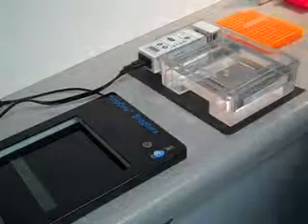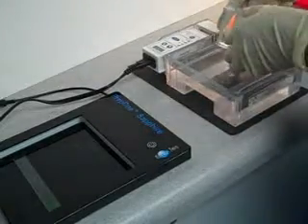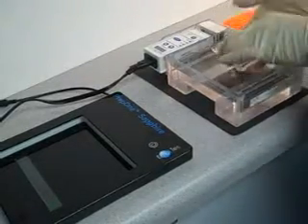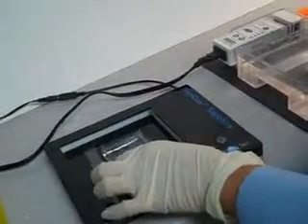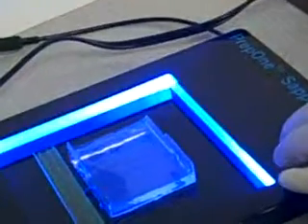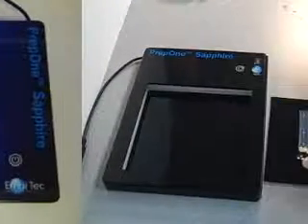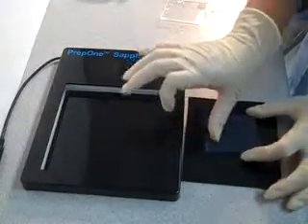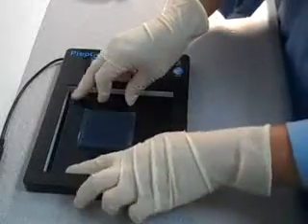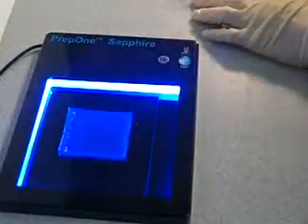When the timer beeps, lift the gel from the tank and place it directly onto the Prep 1 Sapphire unit. You can use our unit to easily check how far the bands have gone. Remember to keep the gel in its casting tray for better visualization of the bands. Confirm the bands are in the right place. Slide the gel from the tray onto the cutting mat and smooth out the air bubbles. Drop the cutting mat into the Prep 1 Sapphire unit and turn it on. After making sure you can see the bands, cut out your particular band.